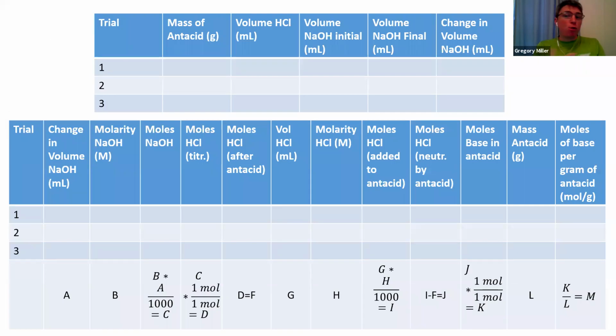So again, this used to be the one and only titration experiment. These are much more complicated. So build from what you learned last week, do those titration calculations, and then you just have to add on the little component of how much HCl did you start with, how much did you find in your titration. The difference is how much your antacid got rid of.